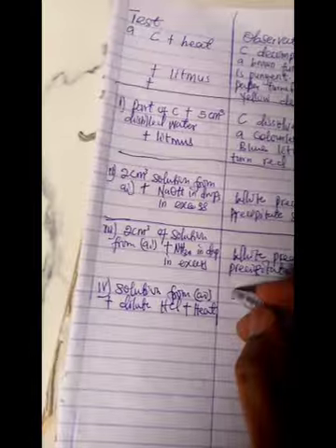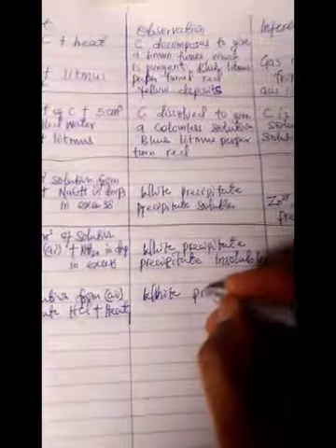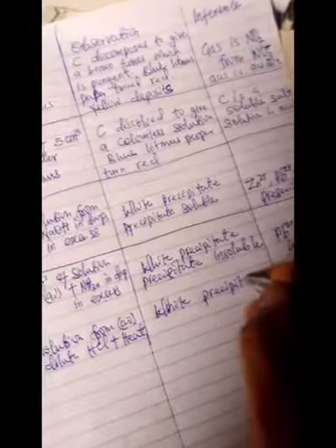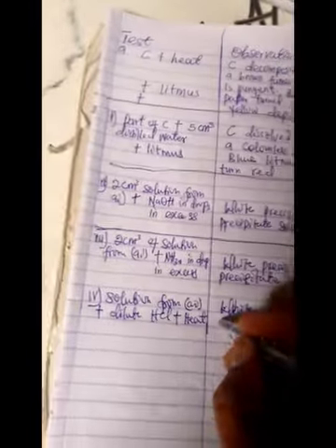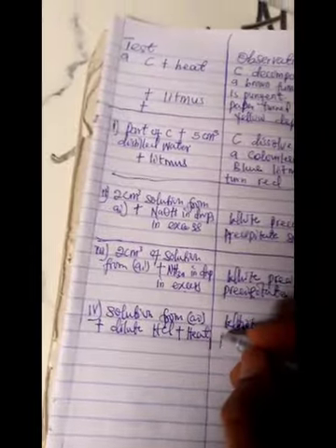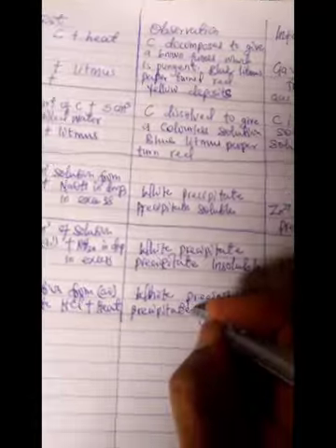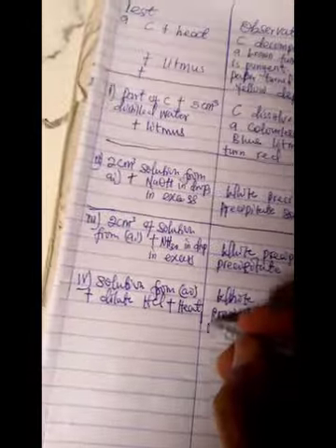You will observe white precipitate. And that white precipitate will dissolve when hot.